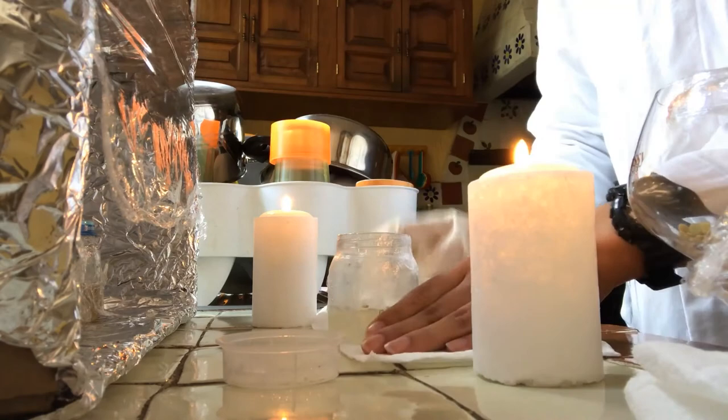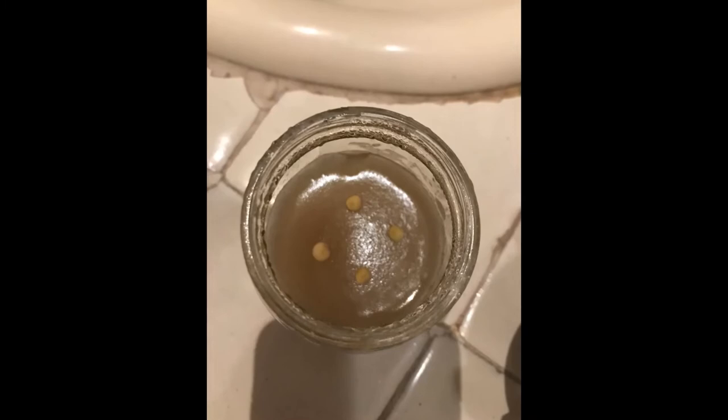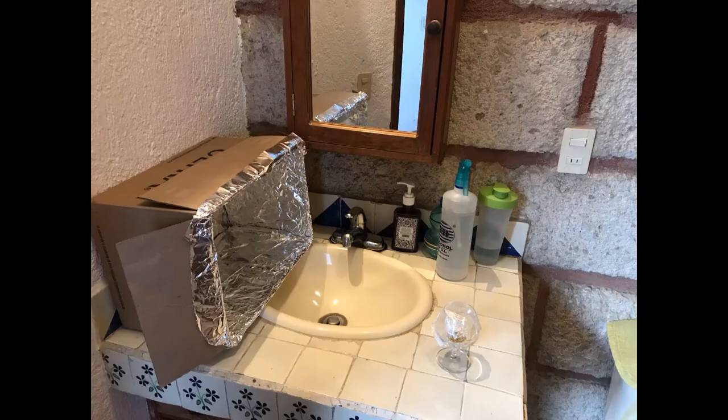During the day, I left the cultures in front of a closed window so they could receive indirect sunlight. And during the night, I left them inside a sterilized bathroom with the light on. I tried to achieve a temperature range between 25 and 28 degrees.